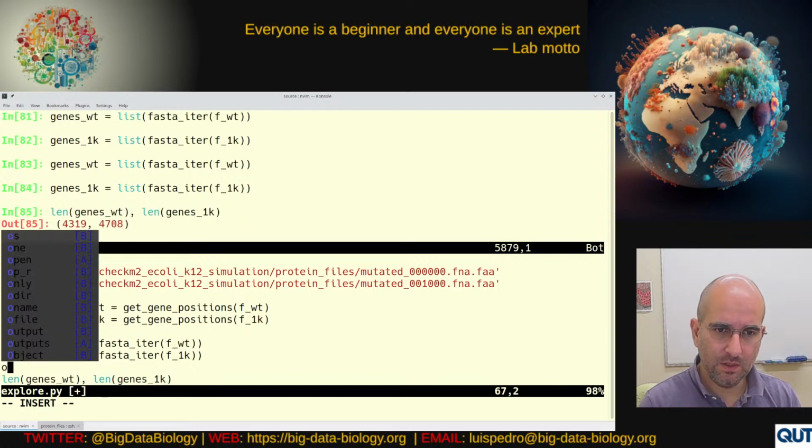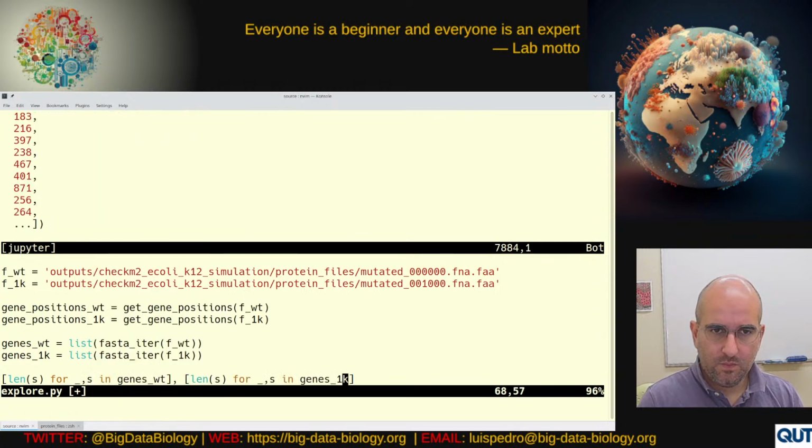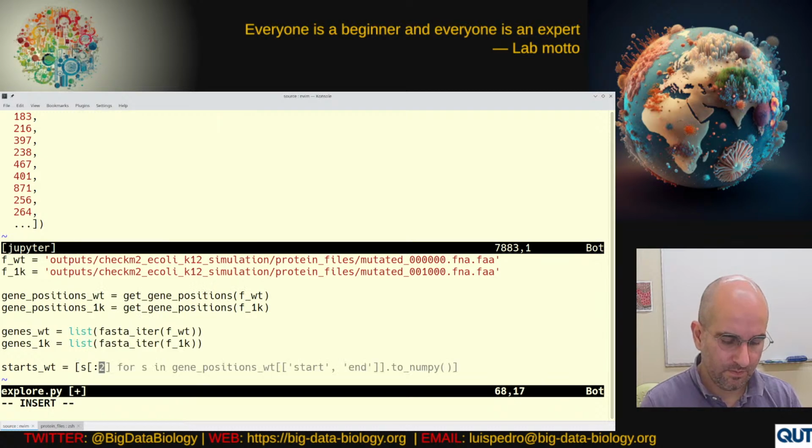Okay, so let's just check something, for example, the first, let's say, 30 amino acids.